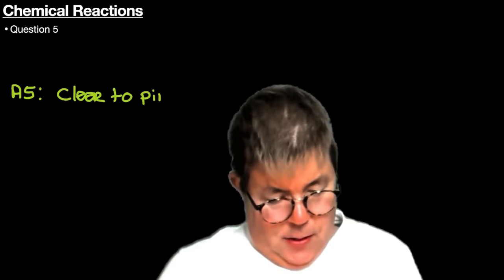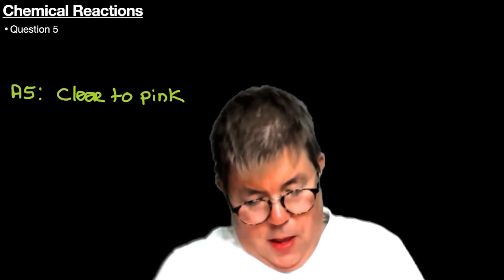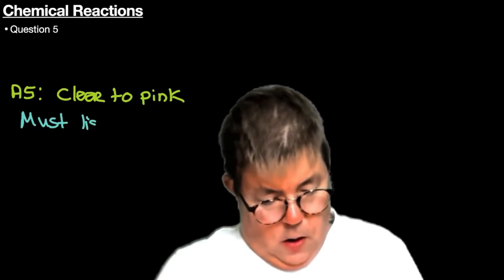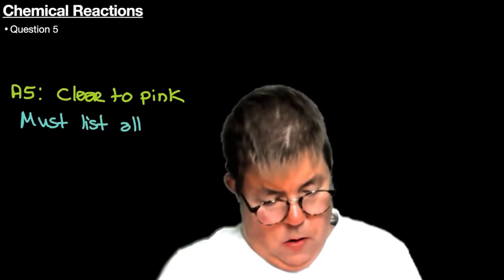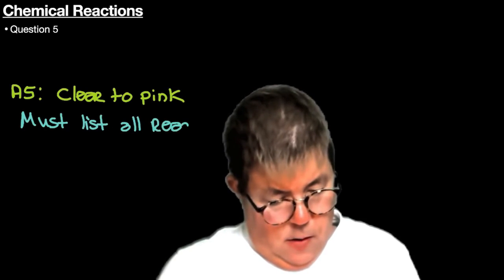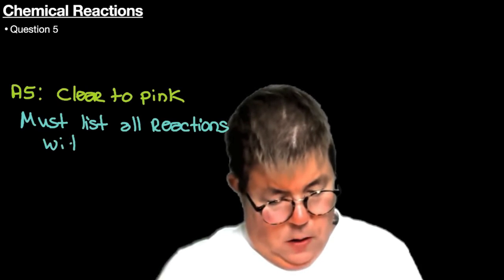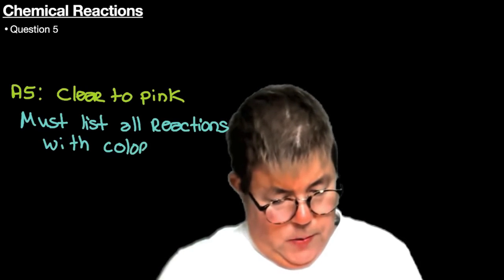So if, let's say, in well A5 we see a color change, I would list A5, and I could write clear to pink as the color change. And again, you must list all reactions with color change.